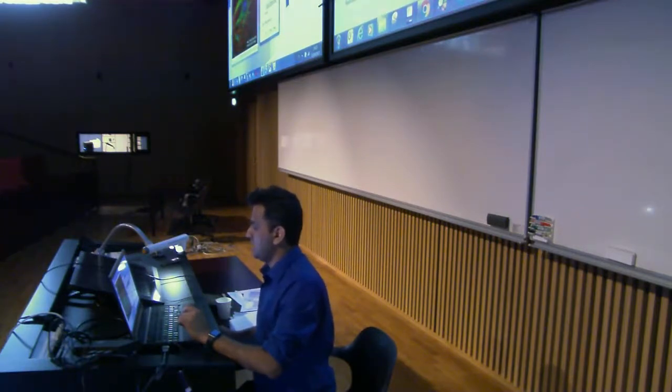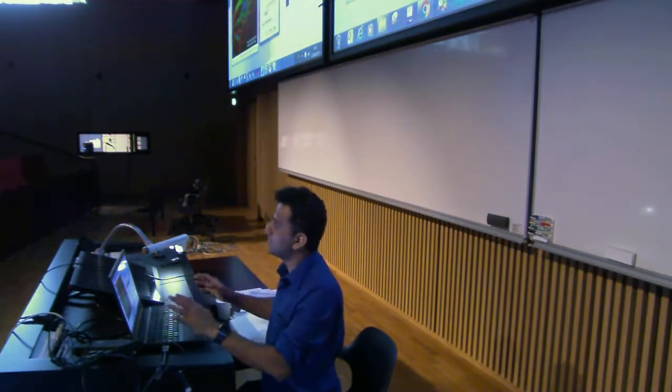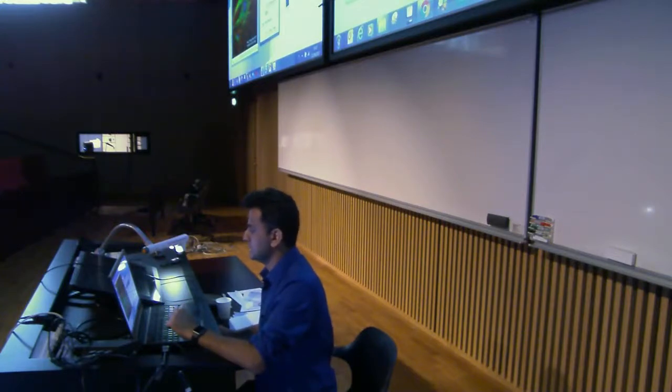And do not switch on this Global option, because once you set global, whatever image you open during this session, this setting is applicable to that image. So do not do global unless you know that in this one session you're going to work on all images which are uncalibrated. So do not switch on this. What I'm telling is that 10 micrometers belongs to 66 pixels.